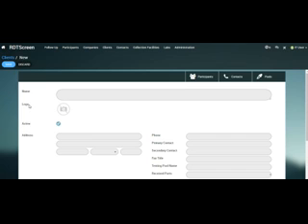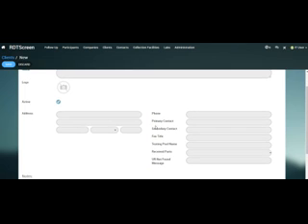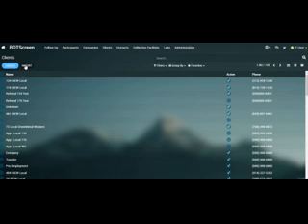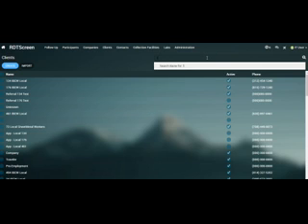Their name, logo, which is the logo that is used on the queue notification sent on their behalf, their address, phone number, contacts, fax title, testing pool name, and how they would like to receive their parts. For the purposes of this demo, I have already created a client that we will test with. So for now, I'm going to discard these changes, which takes me back to my list view of clients, and I'm going to use the search bar to find the client that I already created.